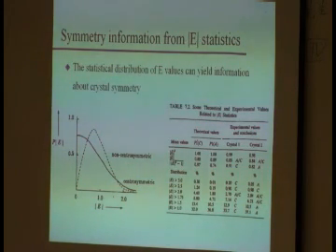So that's obviously important for assigning phases, right? Centrosymmetric, it's 0 or 180. Non-centrosymmetric, it could be anything. And there's a lot of theory behind this. I'm not going to ask you to actually go through that theory. I'm not even going to ask you to remember these things. I just want you to know you can distinguish a centrosymmetric and a non-centrosymmetric structure by looking at your statistics.